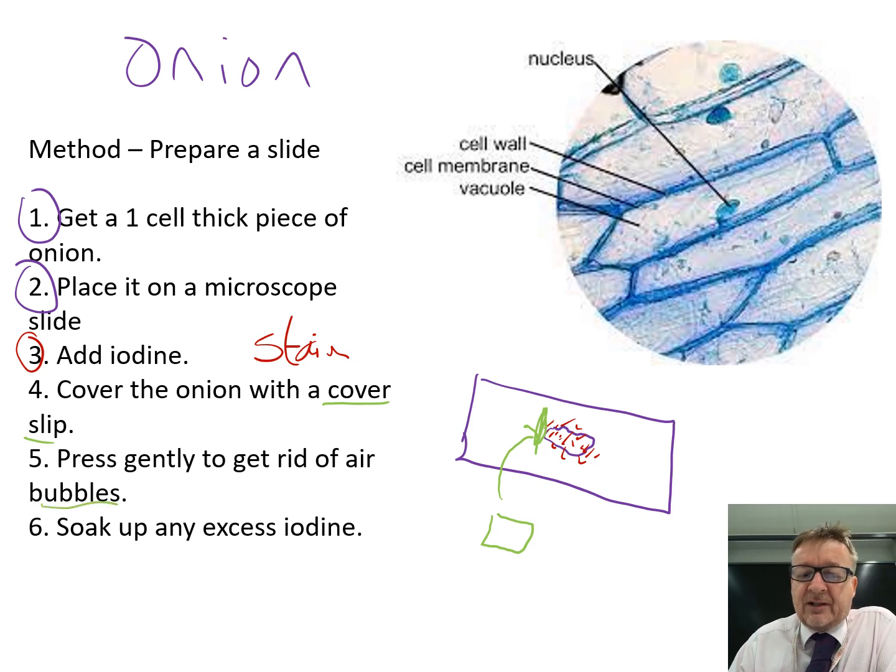Once you've gently pressed and removed the air bubbles, get a piece of paper towel. Because you've pressed the cover slip, some iodine comes out - soak up any excess iodine from around the outside with the paper towel.